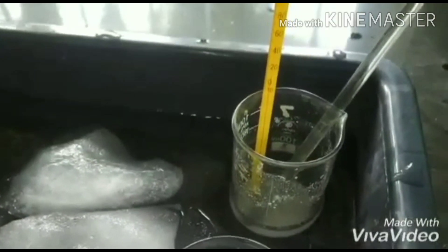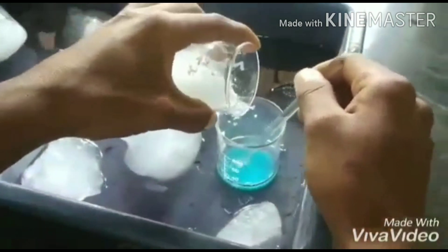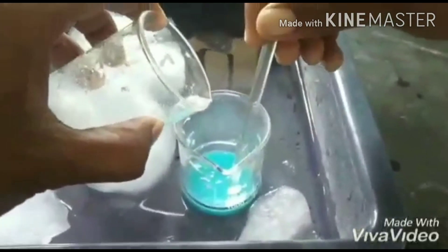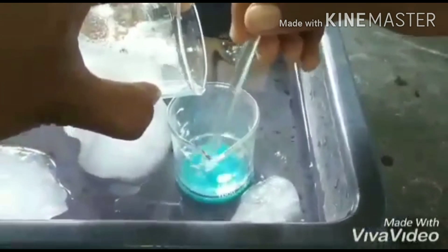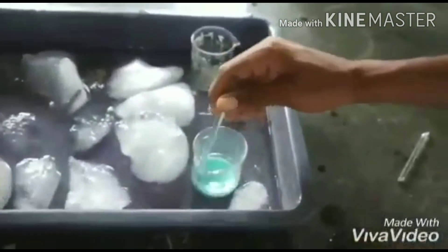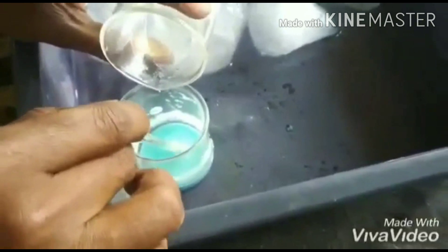Then we will add the cold solution of thiourea into the cold solution of copper(II) sulfate with constant stirring. The solution is then left to stand for about 10 minutes. Oil drops appear on the sides of the beaker.